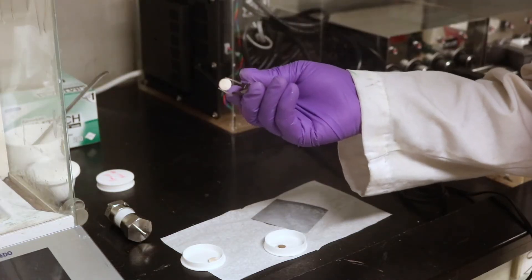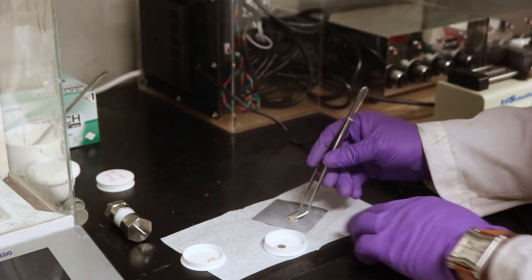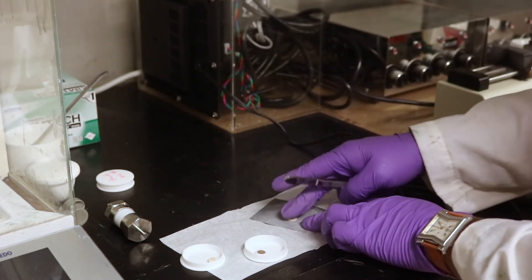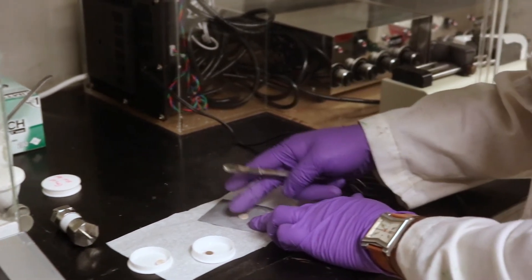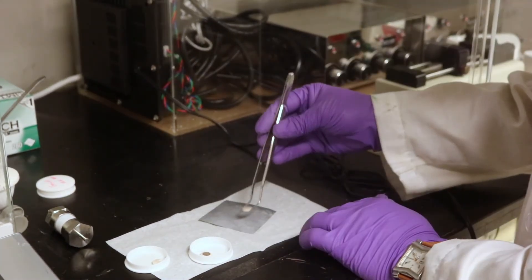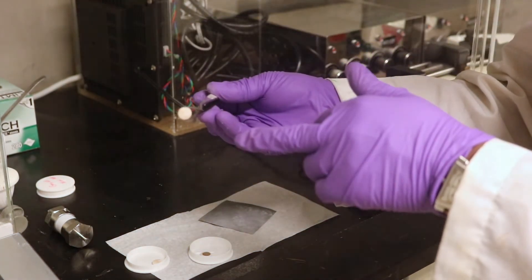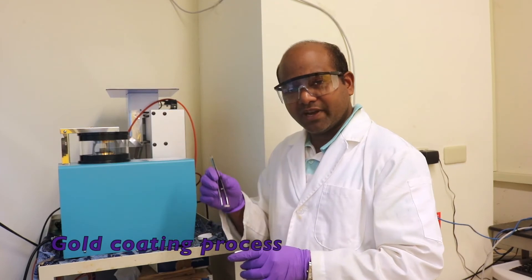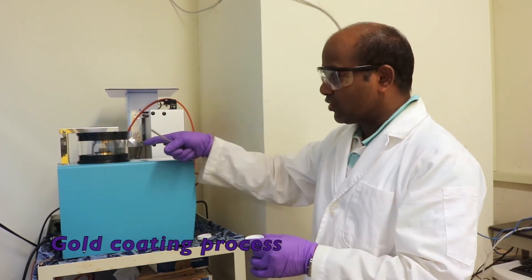The sintered pellets are polished to a mirror-polished surface. These pellets are then gold coated on both sides. After polishing the pellet, we gold coat on both sides. This is the gold coating machine.